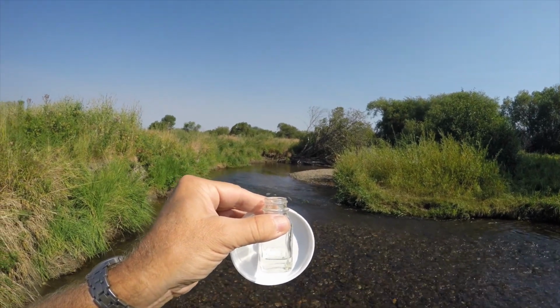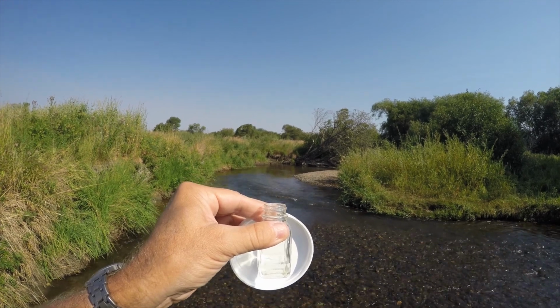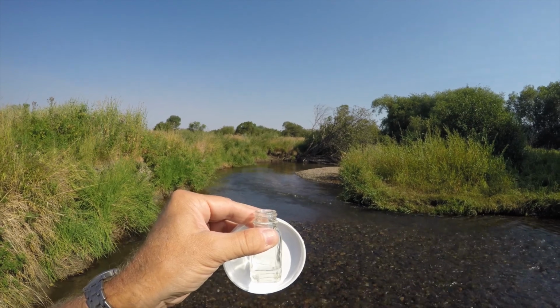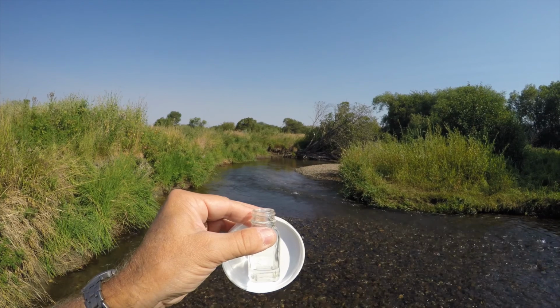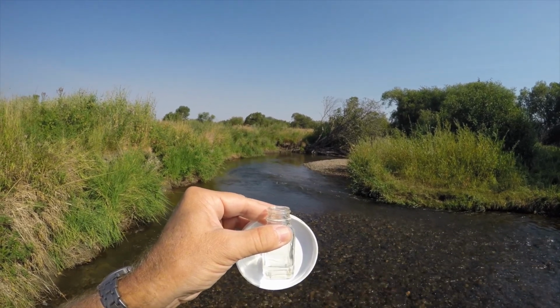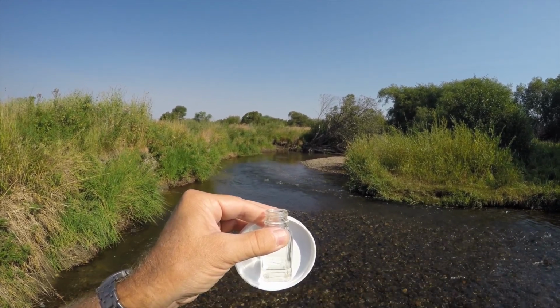I don't know if you could tell on the camera, but it did change ever so slightly, so that drop counts. 10 parts per million today. Very, very good oxygen content. In fact, we said that 10 was going to be about the limit today, so it's pretty much full. It's at as high a level as it can go. So excellent oxygen.